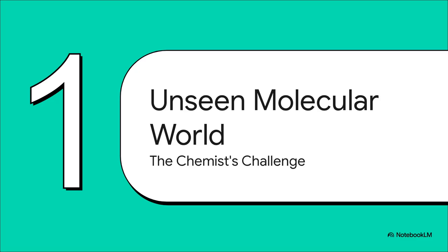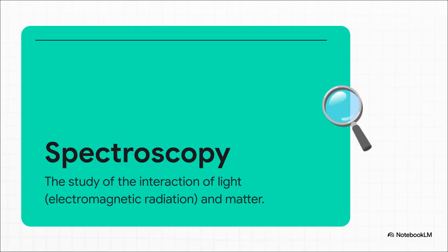How can we possibly figure out a molecule's shape, what its bonds are, its whole structure? Well, it turns out the answer is you have to talk to the molecules. And the language you're going to use? It's light. This is where our amazing tool comes into play, spectroscopy.